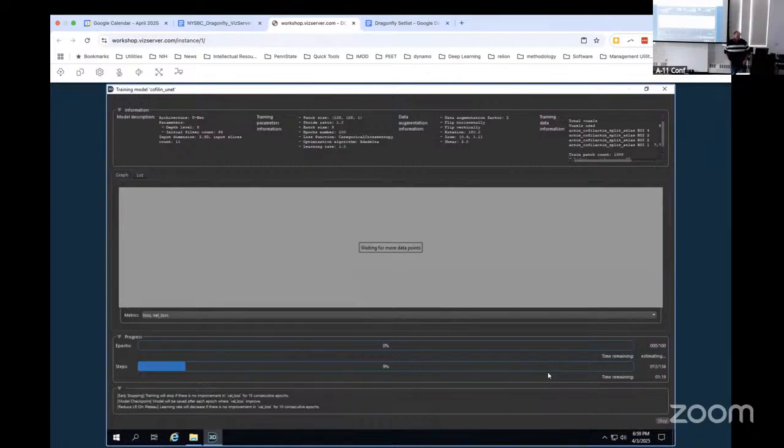Sorry, what should the input and output be? Yes, so the input is your fake tomogram. It's called cofilactin split something tomo. And then the output is going to be called multi-ROI from 4 ROIs. Yeah, there you go.